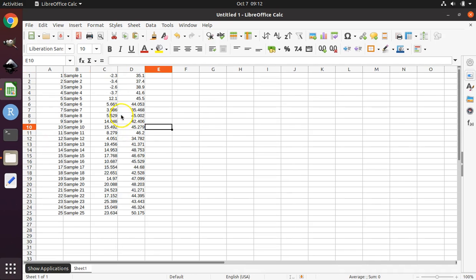The next step is to add the GPS data as I'm showing you here on your screen. So you'll need to pause this video and go through and type in this GPS data as you see it into your file. Now, the important thing to note here is that the first column refers to longitude.